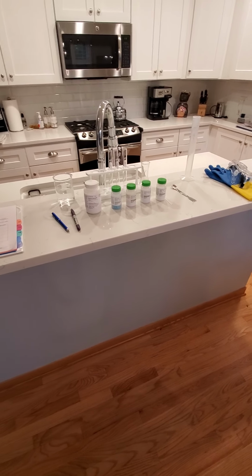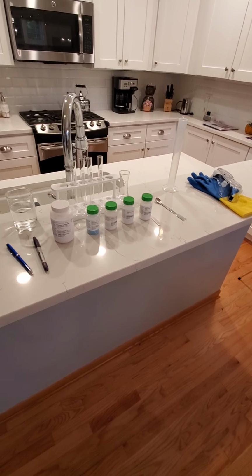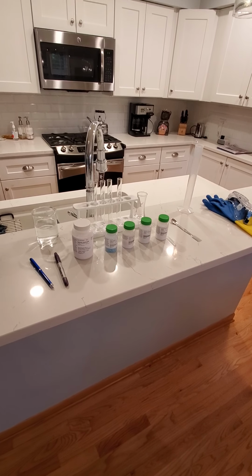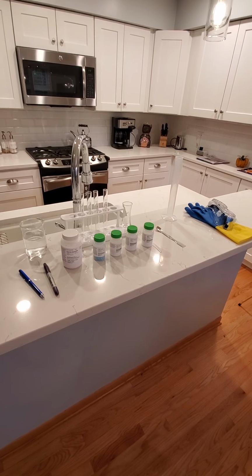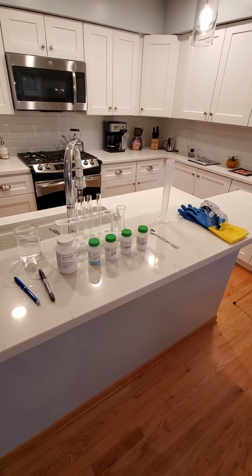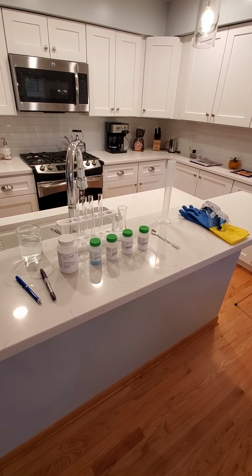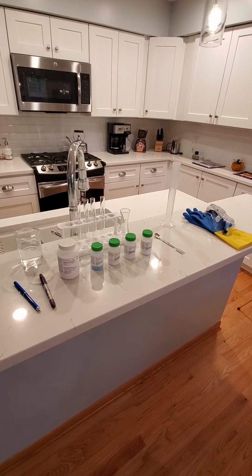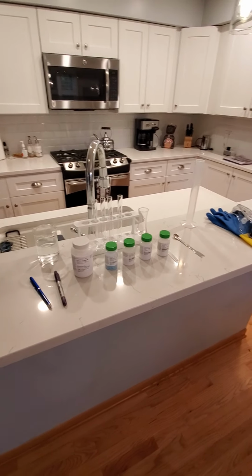Okay, class, this is going to be a little video about Lab 10, and the title of it is Solubility. After you've worked through the pre-lab calculations and worksheet, there are actually two parts to the lab. The first one is called qualitative measurement of solubility, and then the second half is called quantitative.